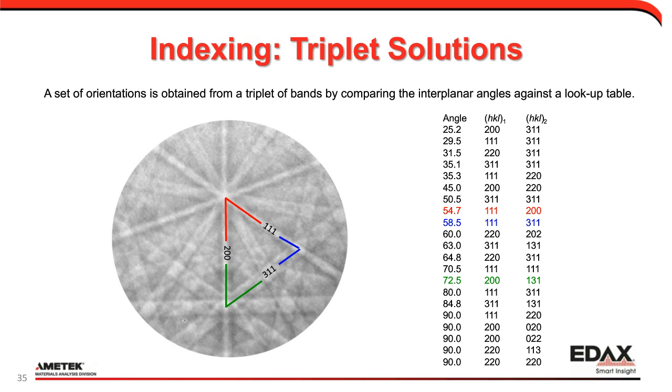So this approach works for regular EBSD. It works for transmission EBSD. We just need to define the reference frame of the sample when we make these measurements. And typically that's done through reading the stage tilt value, and inputting any pre-tilt holder that's used as well.